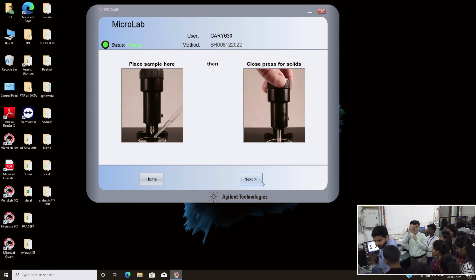Then putting in the solvent and measuring I, we get a spectrum of solvent. Again, I0 is air, I is solution. From these two scans, we get a solution spectrum. After getting the two spectra, we subtract the solvent from the solution spectrum. Then we will get the solute signal.